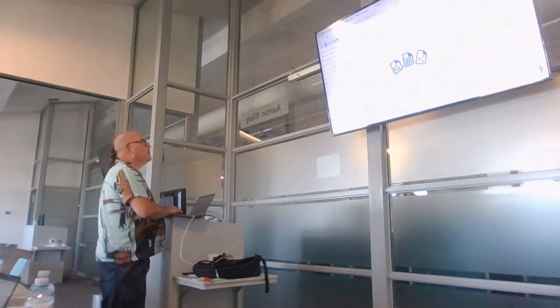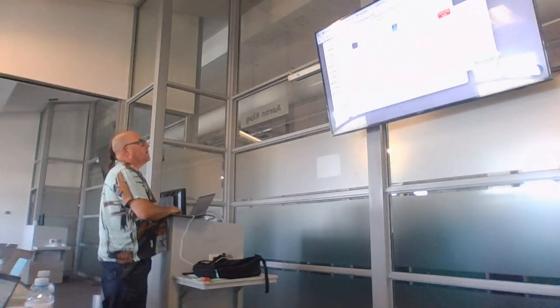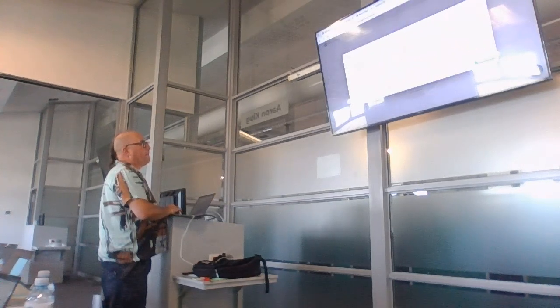Sorry, so where's my file browser? First I need my tree, and then I need my metadata. Continue. Did I break something?